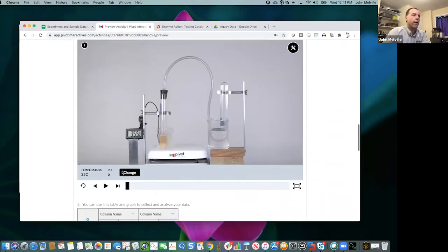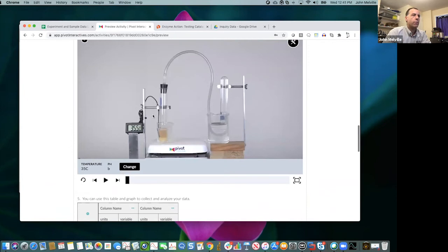And there's an introductory activity, but then what's really interesting as well is, oh, hold on, someone had a question. Does graphical analysis work on Chromebooks? Yes, graphical analysis works on Chromebooks, it works on iOS, it works on Android, it works on everything. So that's what I was saying: those LoggerPro data sets, there's a real simple way to move them into graphical analysis so your students could use them on whatever platform you want. But graphical analysis works on any platform.